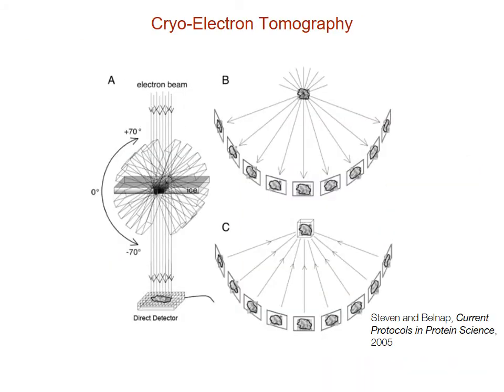In general, it has been very difficult to obtain the native structure and spatial organization of large macromolecular complexes inside single cells due to the limits of the data acquisition techniques. However, the recent revolution of cryo-electron tomography has made obtaining such information possible. This is an illustration of how this imaging technique works.